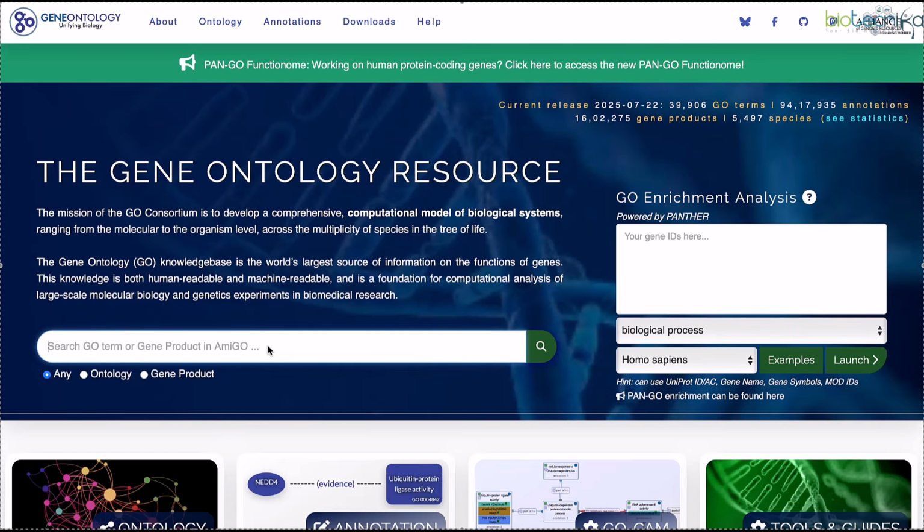First things first, we'll look at gene ontology terms. We will take a gene, for example. You can take any gene, but I will take a very well-known gene, BRCA1, which is responsible for breast cancer. If you directly want to go to ontology terms, you can always click on ontology and then search, but as you might be new to this particular web server, let me show you what options it gives.